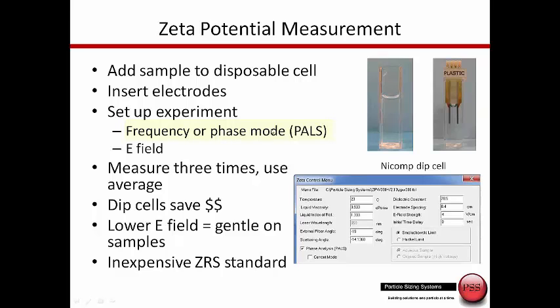We're going to measure the motion of the particles either using frequency or phase shifts. The phase analysis light scattering, or PALS, is more sensitive, so that's how I do all my measurements. We apply electric field, we use PALS, and we can convert the mobility of the particles to the zeta potential. Typically I'll take multiple measurements, take the average. Like anything else in particle size, it has to be repeatable to be believable.